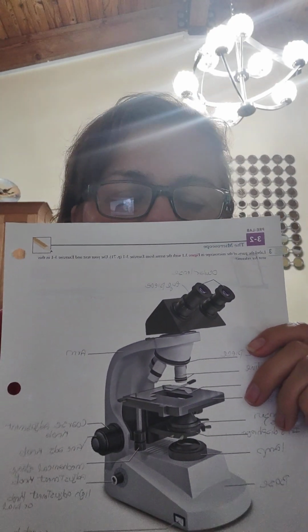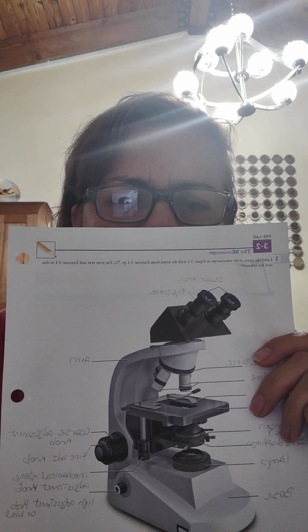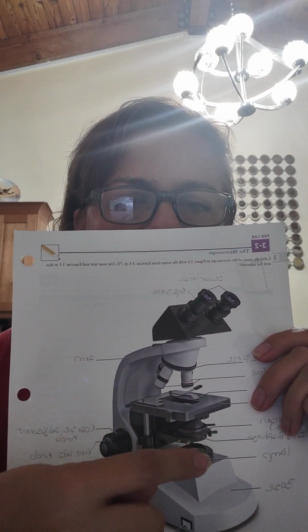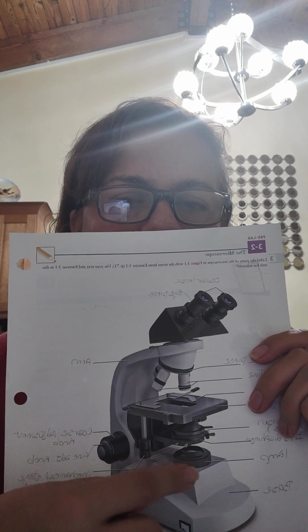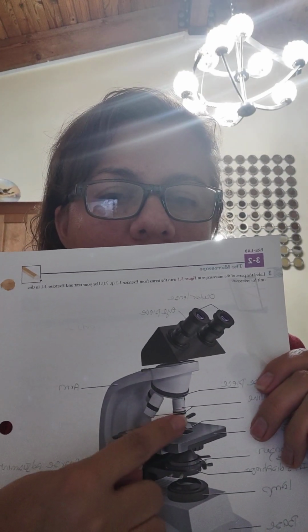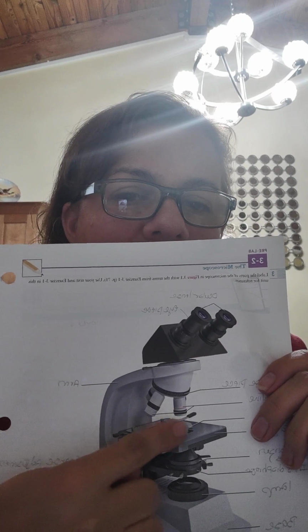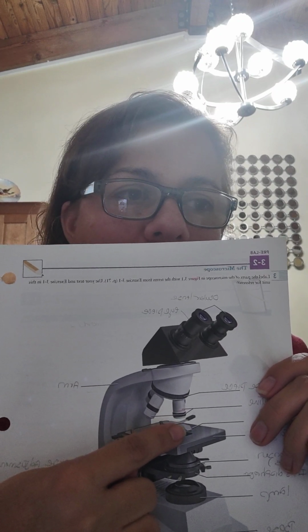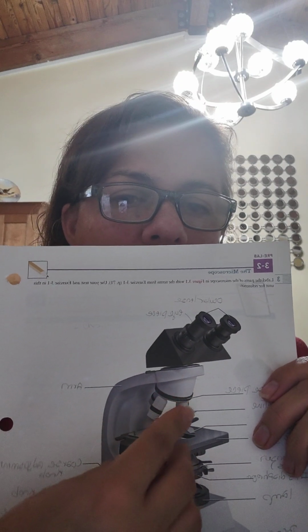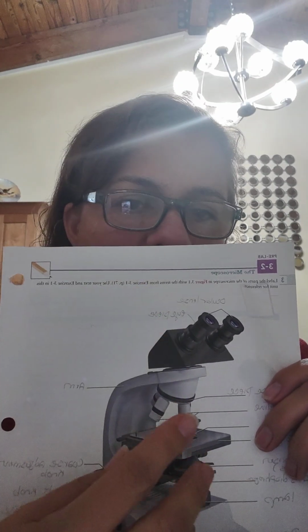Okay, and I think I have my 5 pieces, but in case I'm missing one, I lost count. Just in case, this is the lamp. You have the knob to turn it on, and once you turn it on, the light goes directly through the condenser lens to the specimen, because you might have the slide, but if you don't provide enough light, you won't be able to see anything. So the light shines directly onto the specimen.